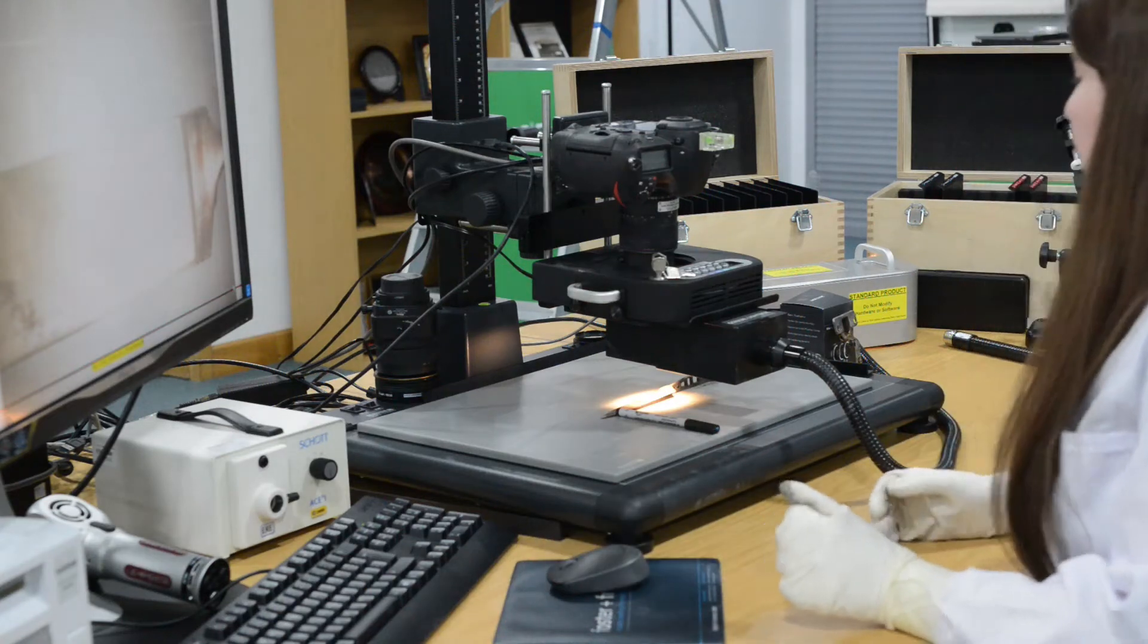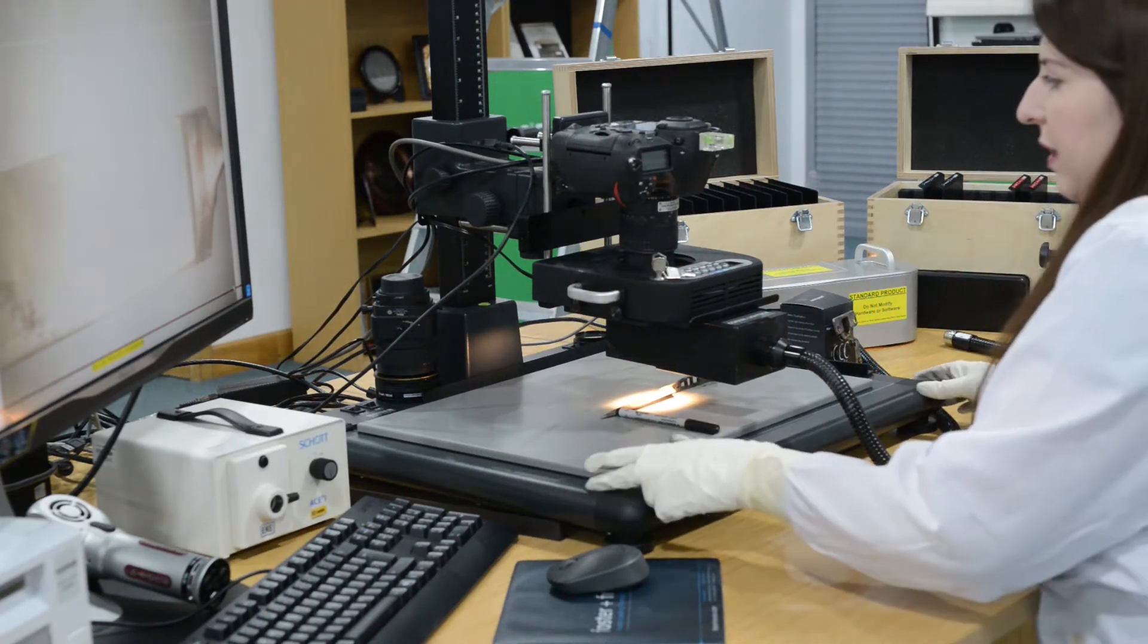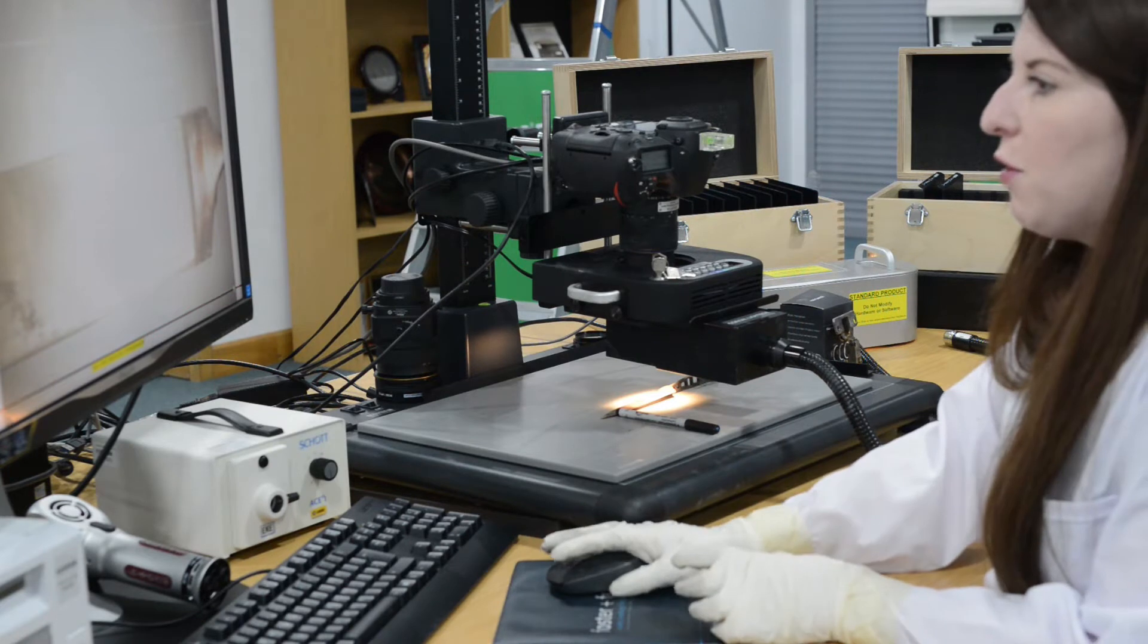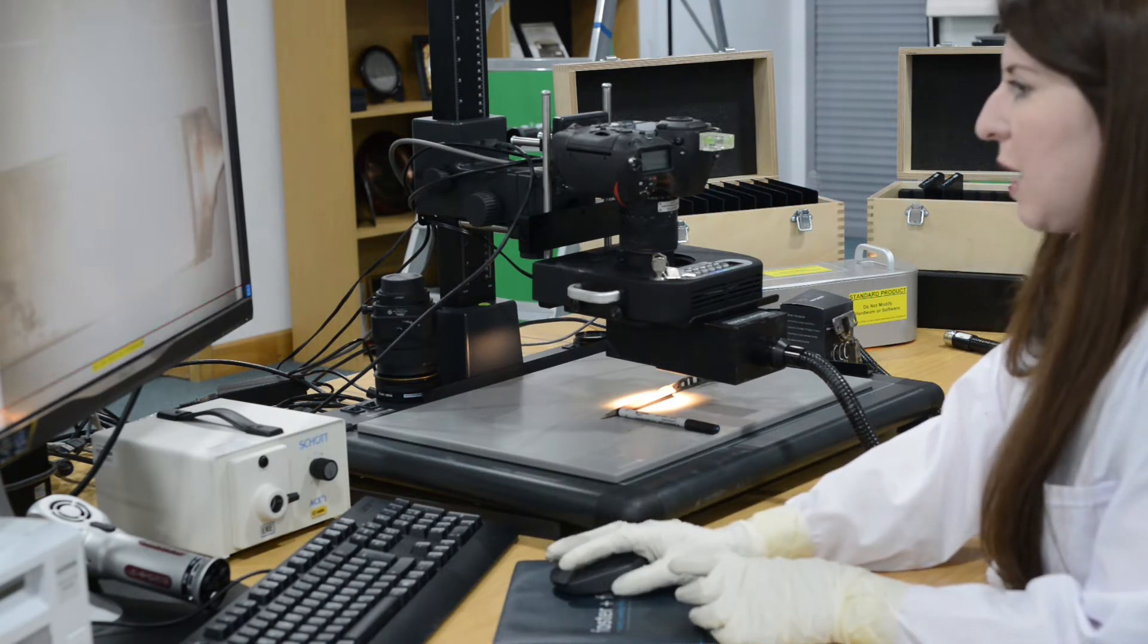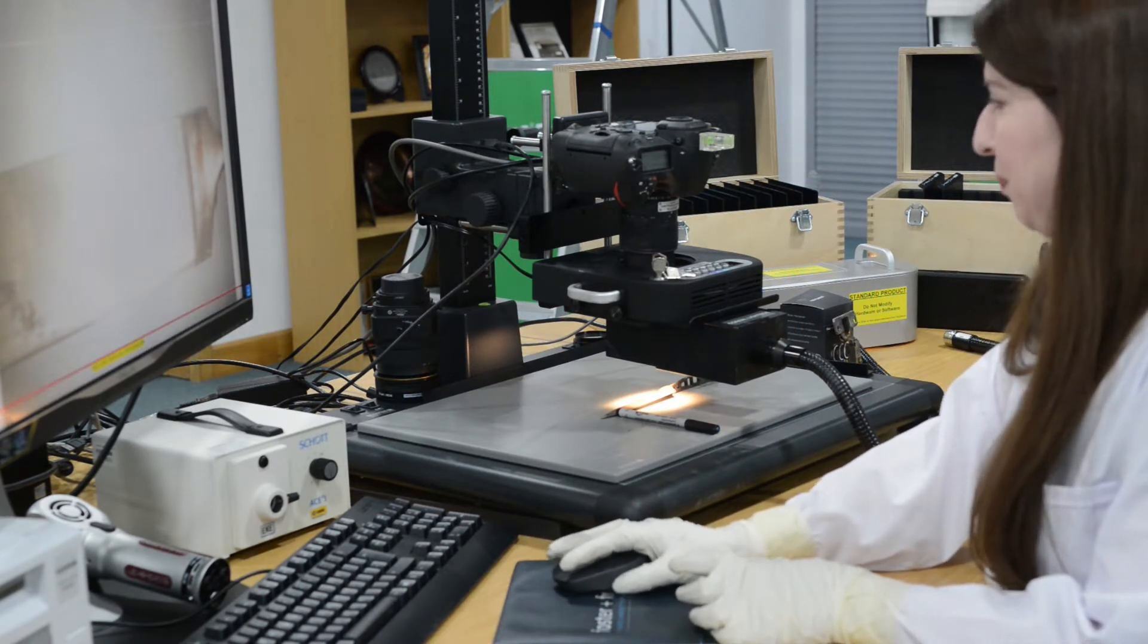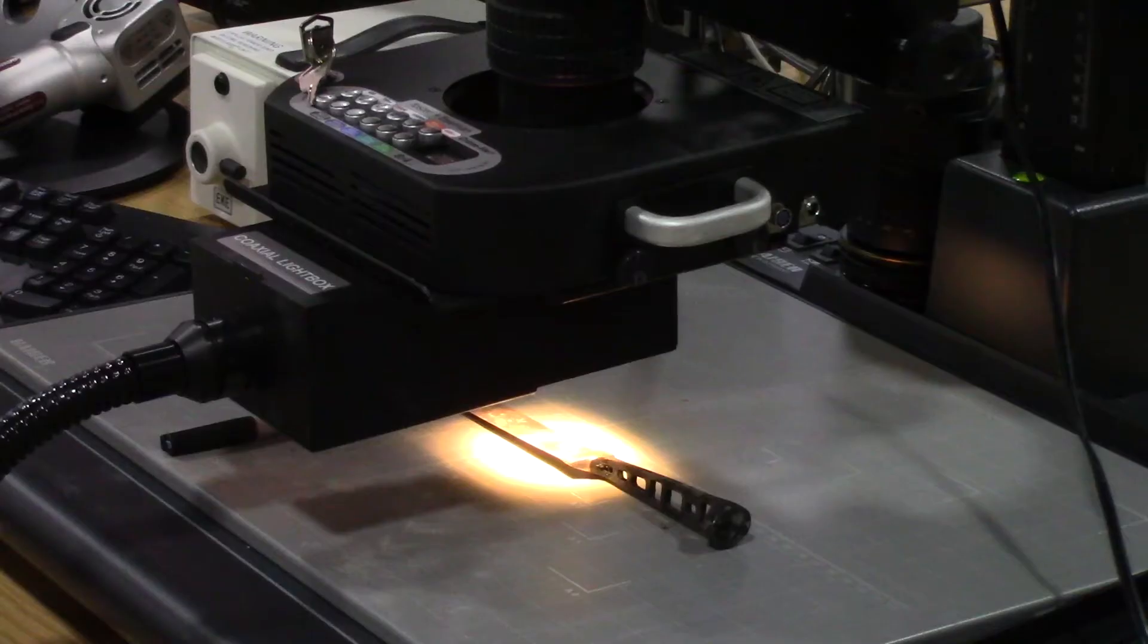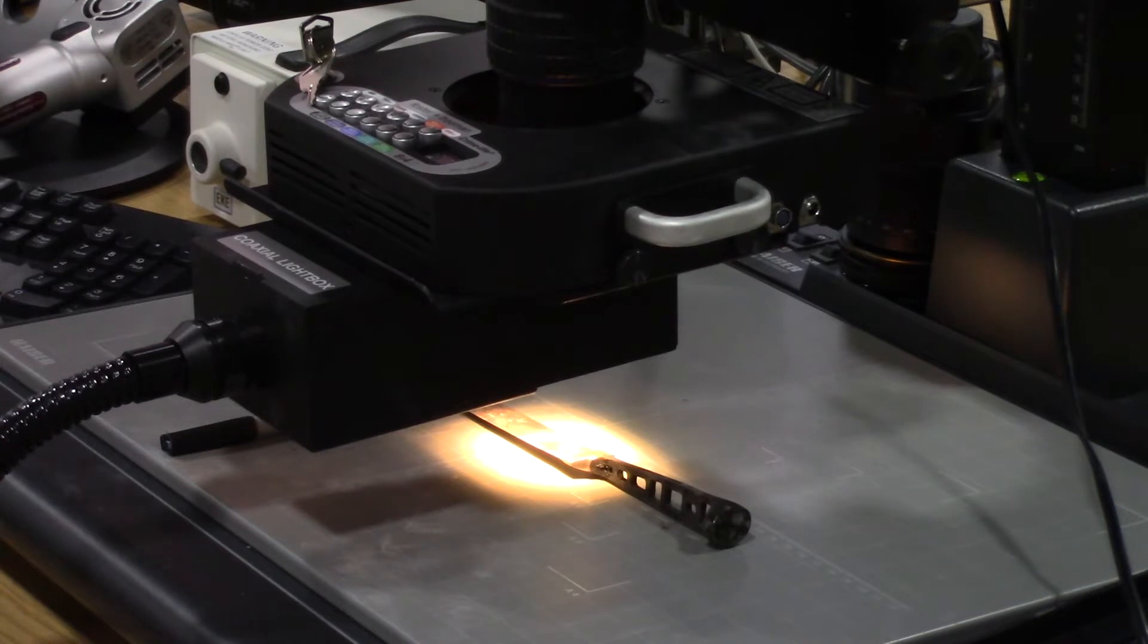So here we have our DCS-5 system. This is our system for imaging finger marks and other types of evidence. But today we're going to use it to have a look at some pieces of evidence that have come from a burnt crime scene.